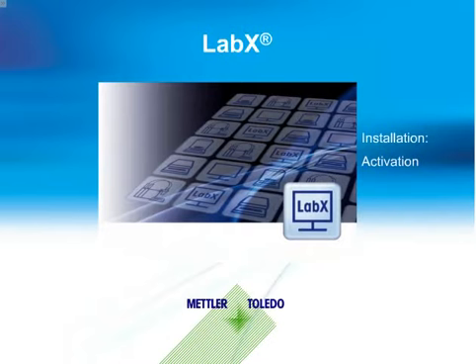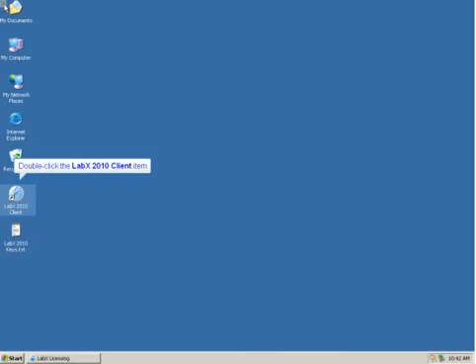In this presentation, we will demonstrate how you can activate LabX after a successful installation, by using the automatic activation functionality. This functionality will work when the workstation with LabX has direct access to the Internet. Locate and launch your LabX application.